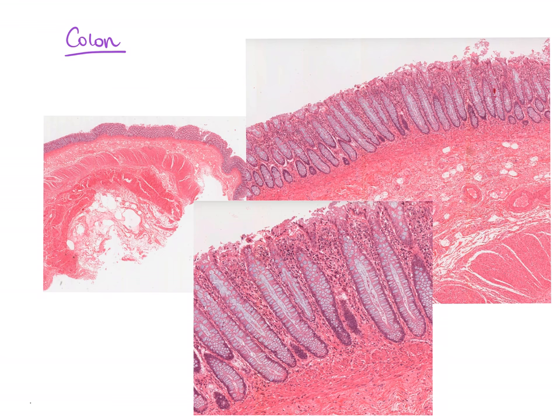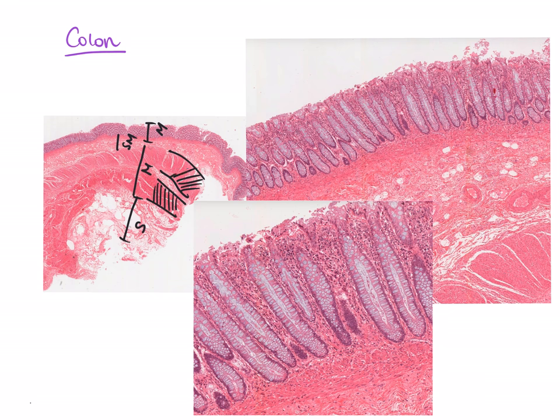Now let's finish off with the large intestine. Again we have low, medium, and high power pictures. There is a mucosa layer, submucosa layer, muscularis layer, and serosa layer. Notably, the muscularis layer in the large intestine has two distinct layers: an inner circular layer and an outer longitudinal layer. The outer longitudinal layer is incomplete — where it exists, these strips of longitudinal muscle are called teniae coli. We're looking at a section through a teniae coli because the longitudinal layer is visible here.